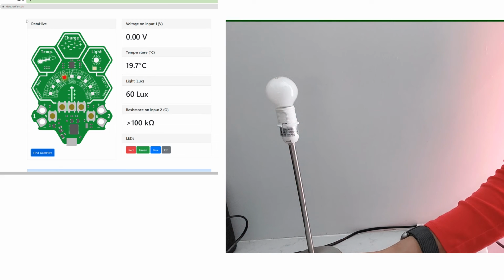This is a great resource for supporting students with calculating light intensity, plotting a graph which can often have challenging ranges in the axes, and it also highlights the importance of data loggers in accurate experimentation.